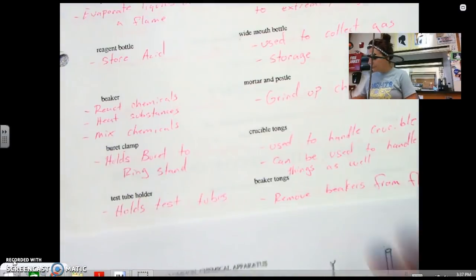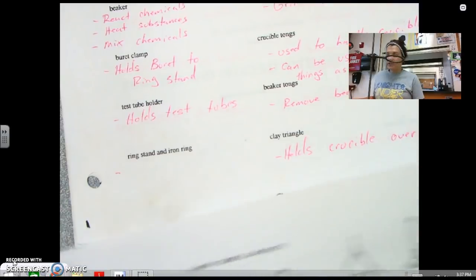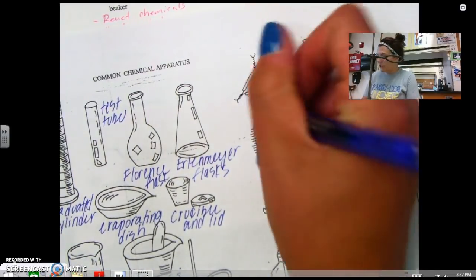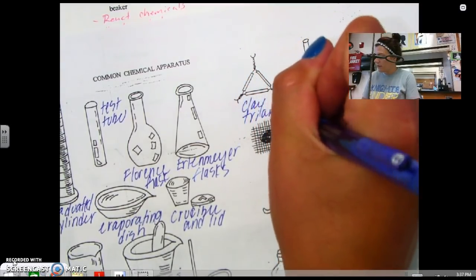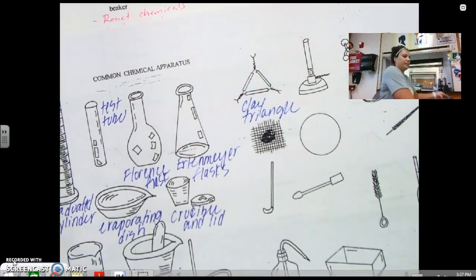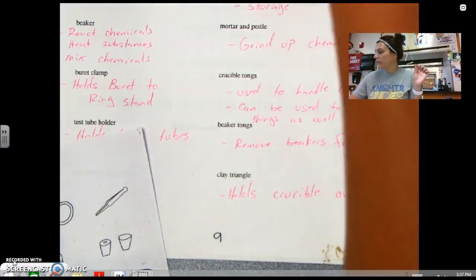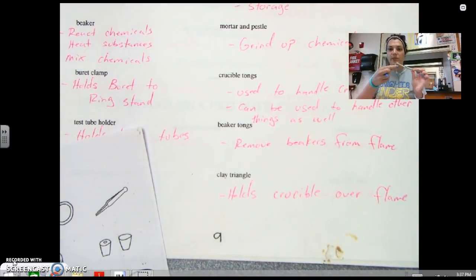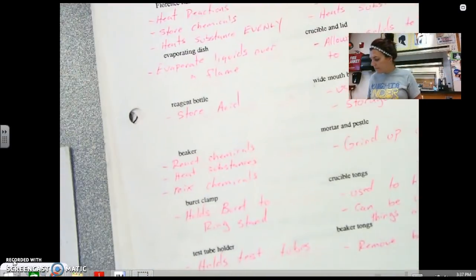So a ring stand, obviously you can write your own definition for that. This guy up here is what I was just talking about. This is a clay triangle. Let me move this out of the way. Clay triangle. Clay triangle holds crucibles in place, so it holds a crucible over the flame. Obviously this is clay because we don't want the metal to burn. Never pull a crucible off after you've been heating it because it's going to hurt your hands.